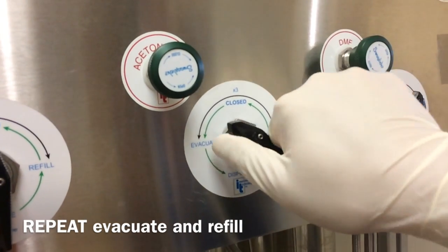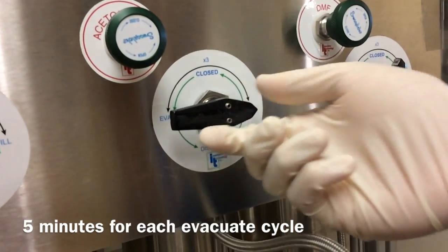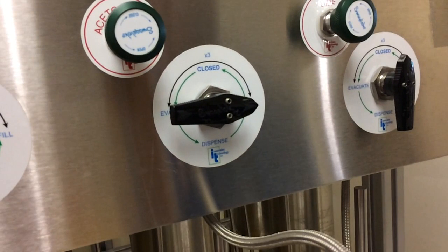As with all good Schlenk technique, purge a total of 3 times. Notice that the black arrow is a double-headed arrow, meaning you can go from evacuate to closed and then refill and back again.